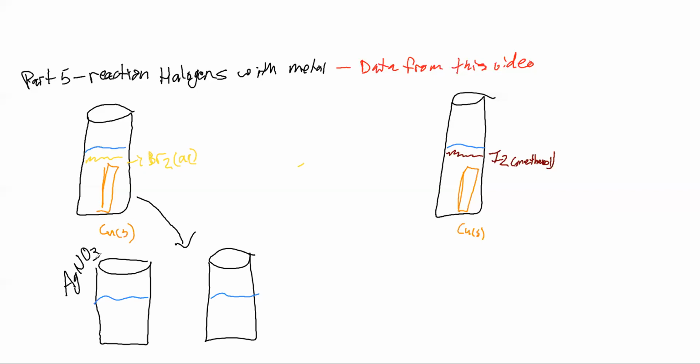Because when you add in silver nitrate, what we're going to produce is a very insoluble precipitate. If there was any bromine in there, what we would see down here at the bottom, actually a little bit on the yellowish outside of things, is a solid that forms, which we would say is AgBr.